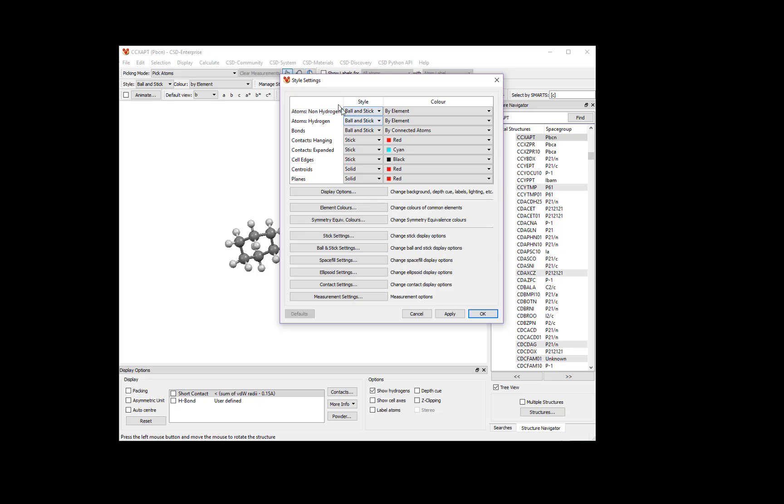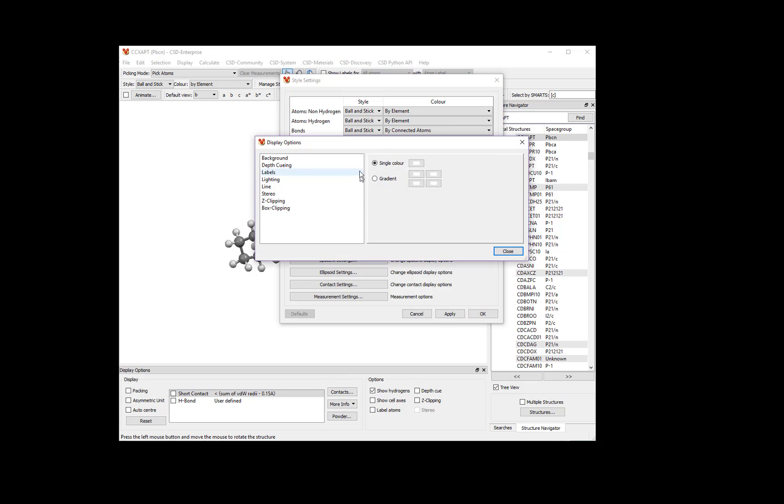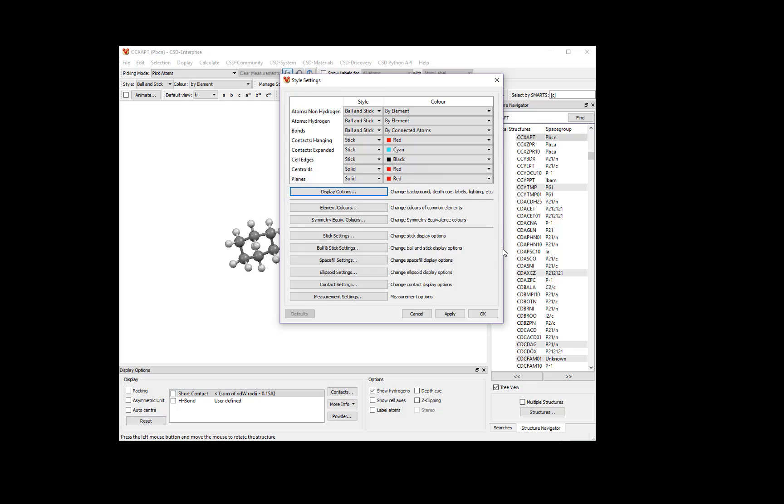Here you can change the way the atoms are viewed, element colors, and other settings. To change the size of the labels, click Display Options, and then in the Display Options dialog, click Labels. Here you can change the label color, the label size, and the label font. When you're done making your changes, click Close.